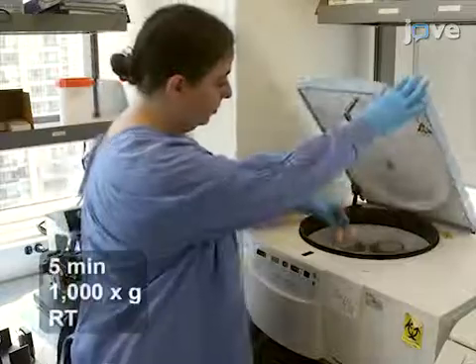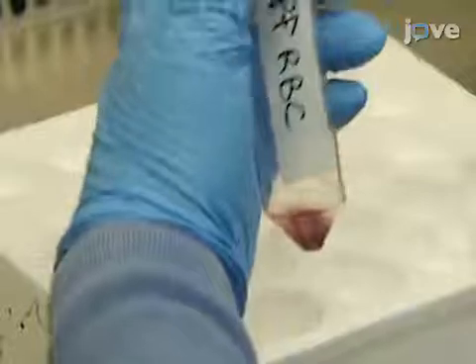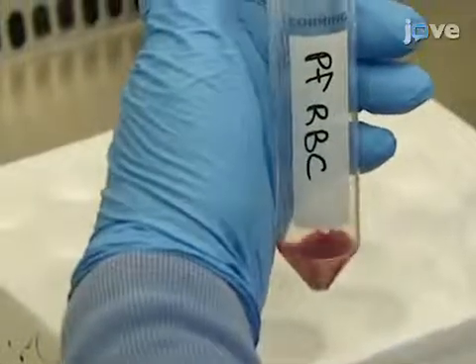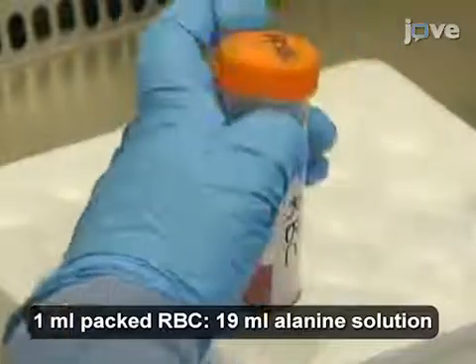To synchronize the parasites, spin down the parasite culture and lyse the trophozoite-stage parasites in the pellet with 19 volumes of 37 degrees Celsius alanine solution at room temperature.